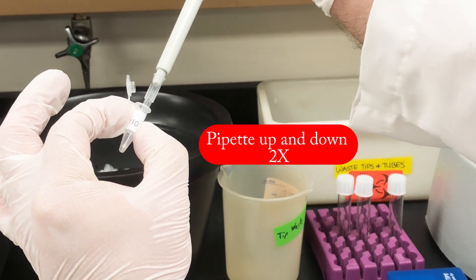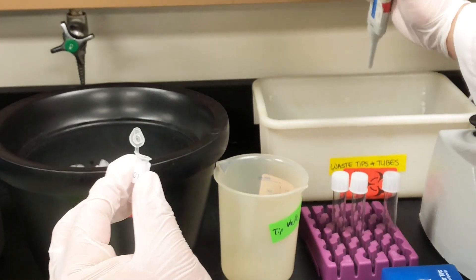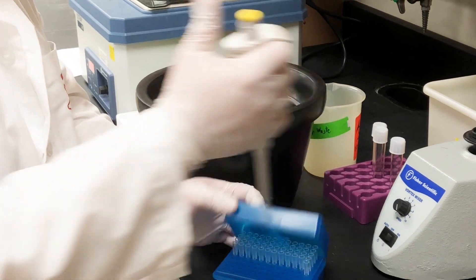Pipet up and down quickly two times. Remove the TE immediately. Place the tube on ice.